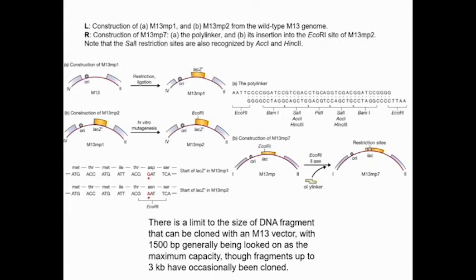So in the culture, if we add the X-gal, that will produce the blue color, all right, and that's how we identify which cell is a recombinant cell and which cell is not. Okay, that's the simple way to explain this. But later on, we have more detail. Okay. Thank you. You're welcome.